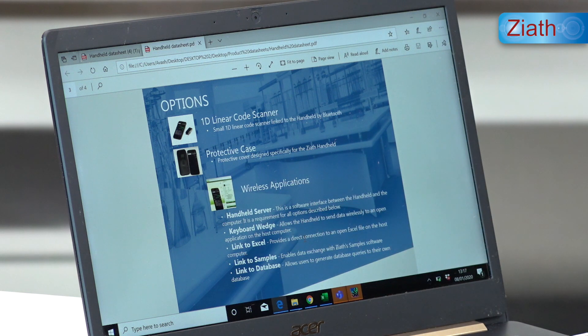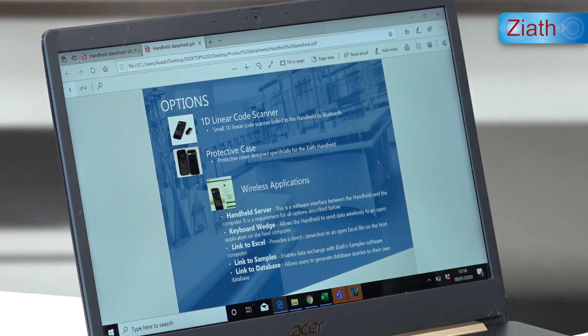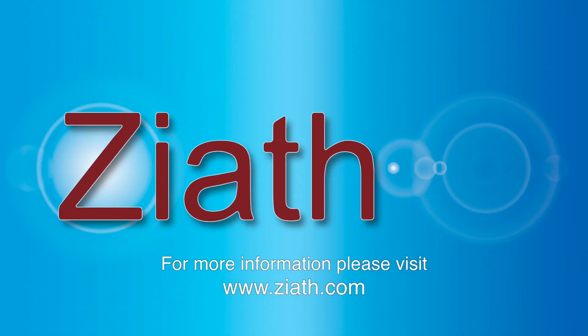Link to Excel enables you to scan a tube contained in an open Excel file on the computer — once the tube is scanned, it will show the sample information from the Excel file next to the tube scanned. Link to Samples will allow the handheld to wirelessly communicate with the sample software; when down at a freezer you can scan a sample, display the sample information on the handheld, and edit the sample, which will update the sample software as well. Link to Database allows the handheld to wirelessly communicate with your database — a tube can be scanned anywhere on site and the sample information will be displayed on the handheld screen. For more information, please visit www.ziath.com.